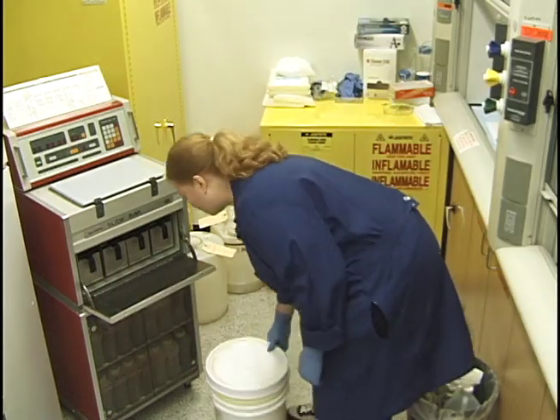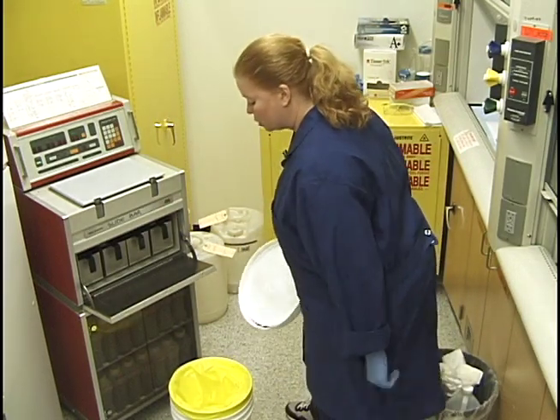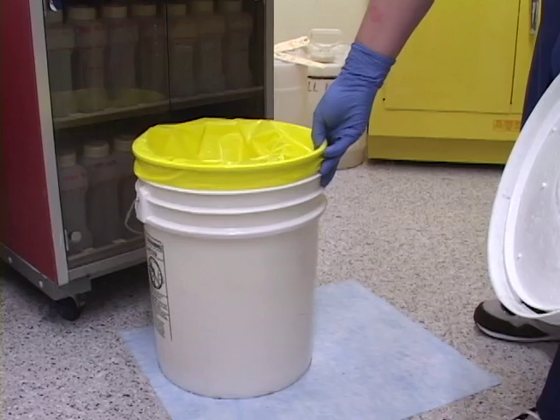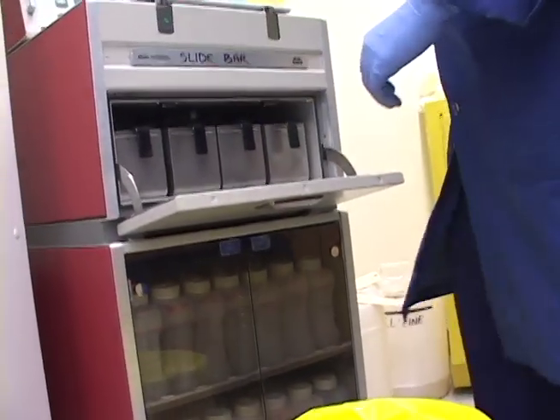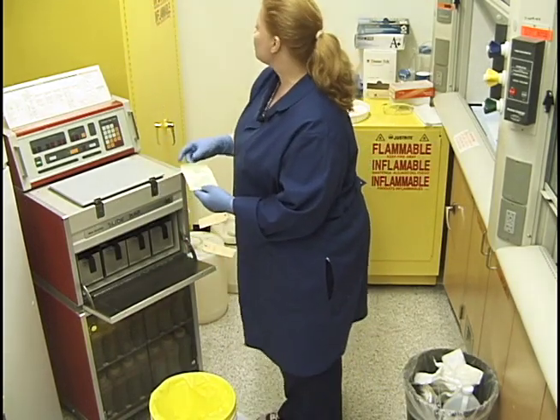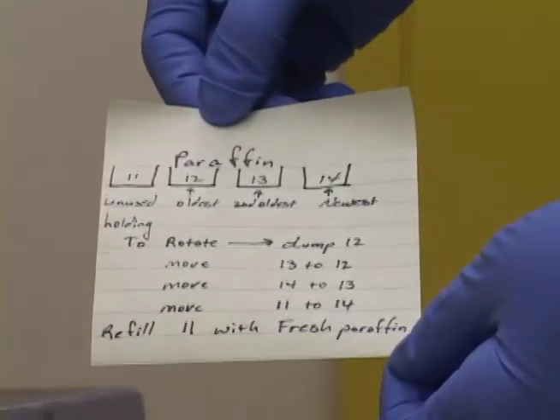I have a bucket here with a yellow bag that I use for dumping the paraffin into, and just in case there's a spill, we have a pad on the floor. I gave myself a little chart and I keep it on the side of this flammable hood, so you can refer to that.